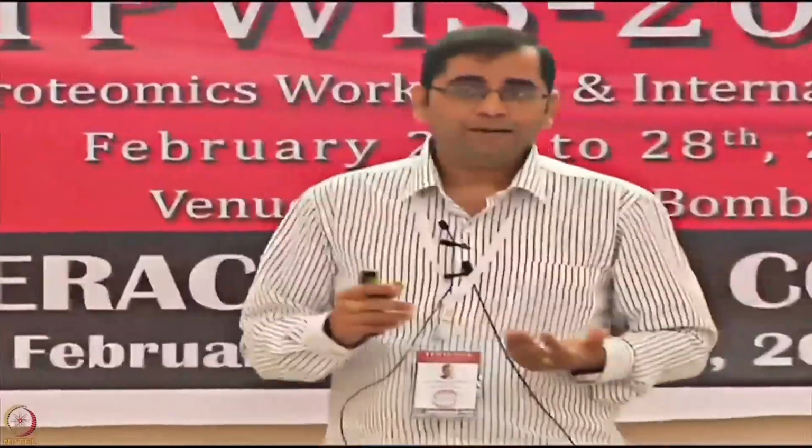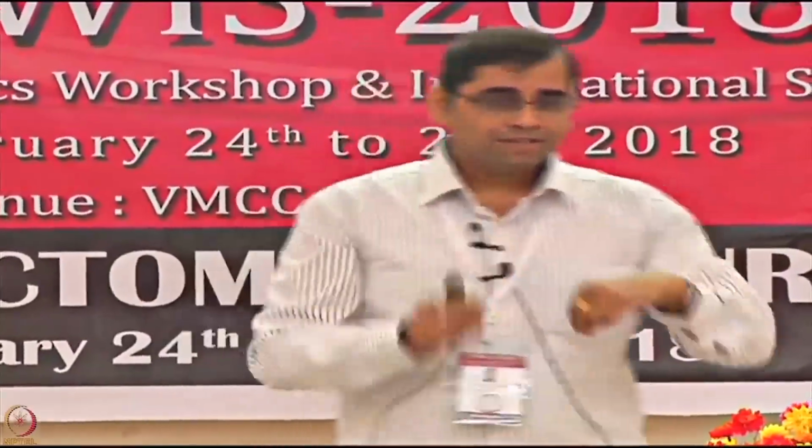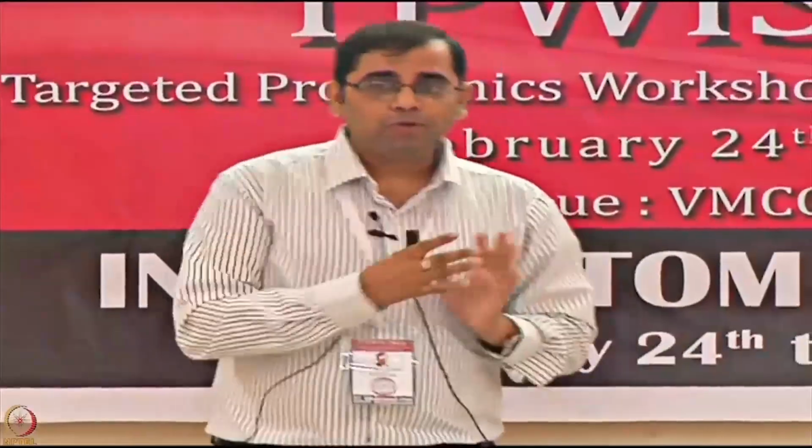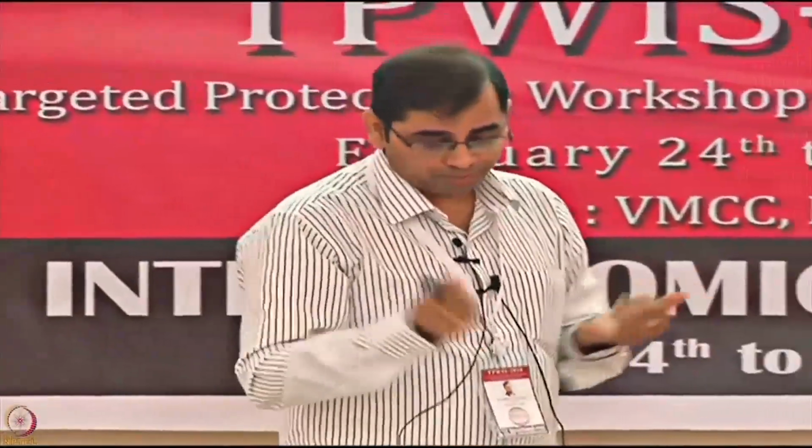In this case here, if binding is not working, you will watch for just 20 minutes, stop it, and now you can bring a new solution, change the concentration, change the temperature, do different pH scouting. So you have many ways of planning to modulate the experiment. You are not going to just wait 10 hours for something to happen and then say, okay, it's happened or not happened.